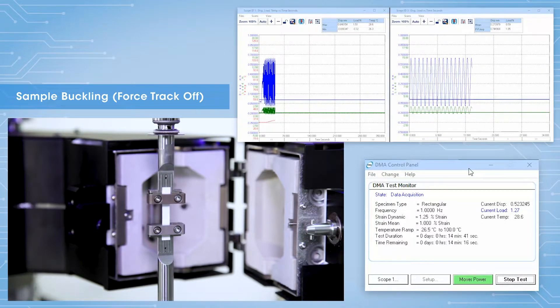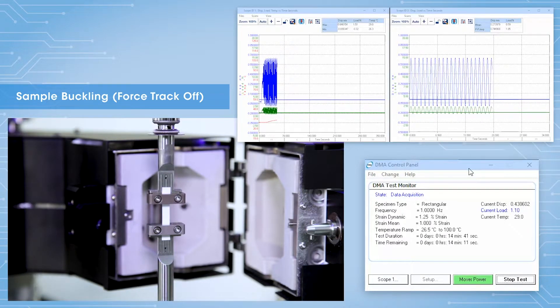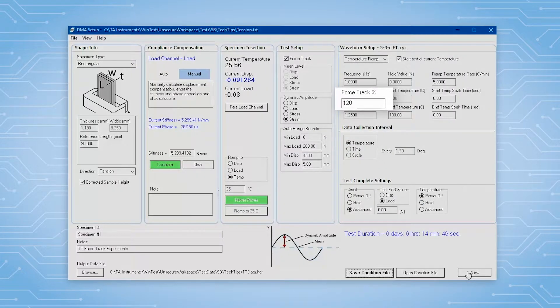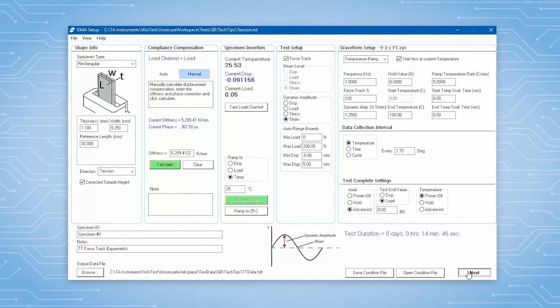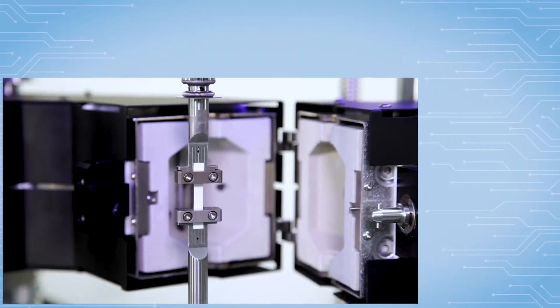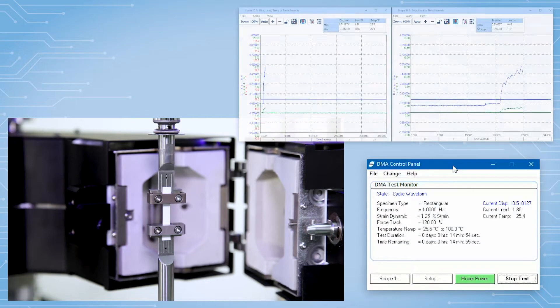However, we like to have a little cushion. So, we go with 120% force track. If we use this new setting, the force would range from 0.2 newtons to 2.2 newtons.